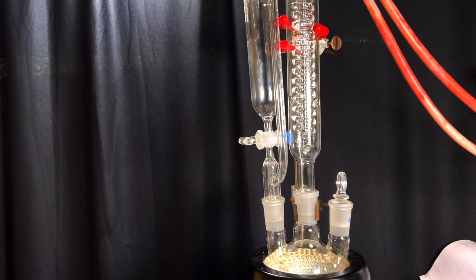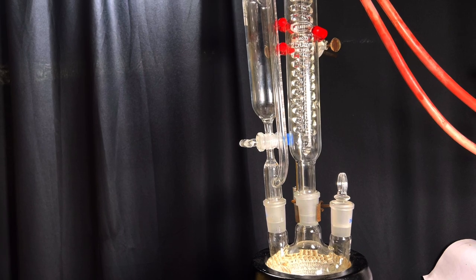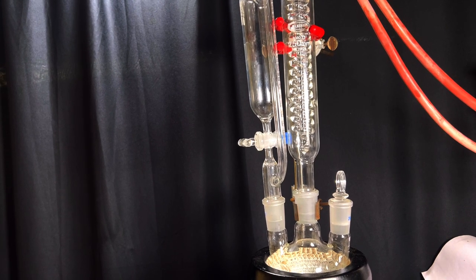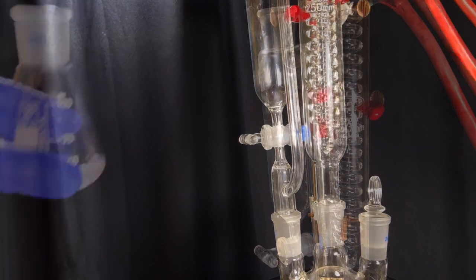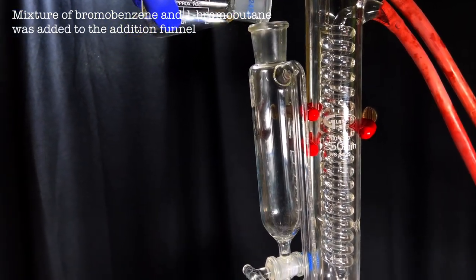An addition funnel and a Dimroth condenser were attached to two of the necks of the round bottom flask and the third neck was closed with a penny head stopper. The mixture of bromobenzene and bromobutane was added to the addition funnel.